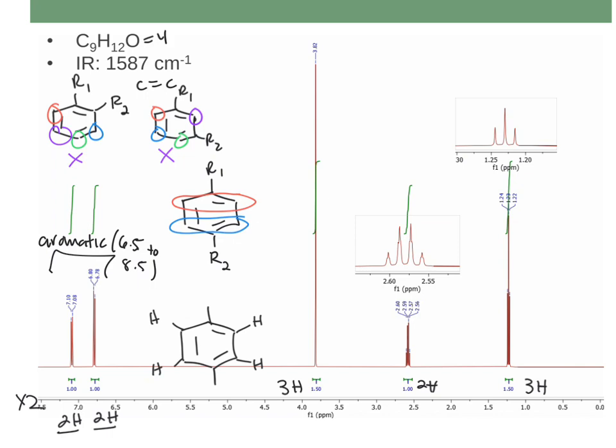And again, I got all that information just from what was here, right? The fact that it's 2. Also, we'll take a closer look. These are doublets. That makes sense, right? These hydrogens should be doublets. They only have 1 neighbor. They should be doublets. So that all matches.